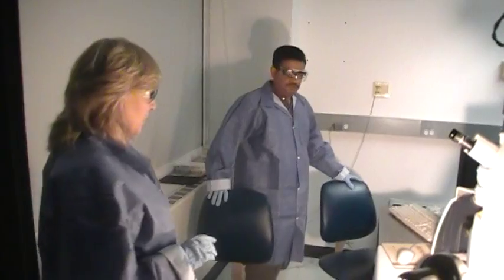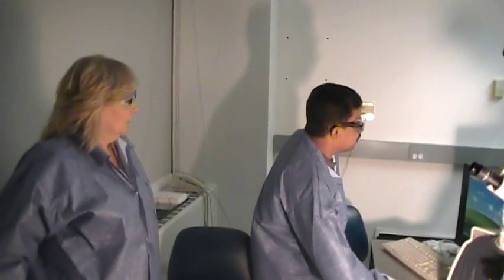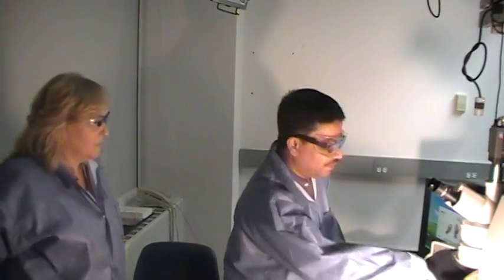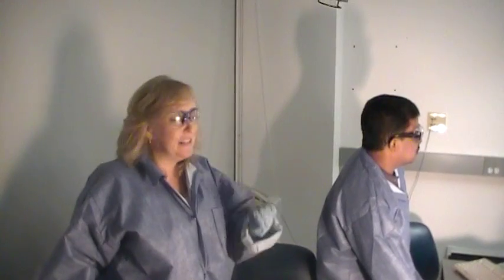We can open up a spectrum to see. What actually happens is that every single piece of material has some type of fingerprint on it, and this is what this is detecting. As the laser light hits into the microscope, whatever the small, minute particle it is, it's hitting and reading it, and as it does, it's forming a fingerprint. We're looking at the spectrum fingerprint of the different objects.